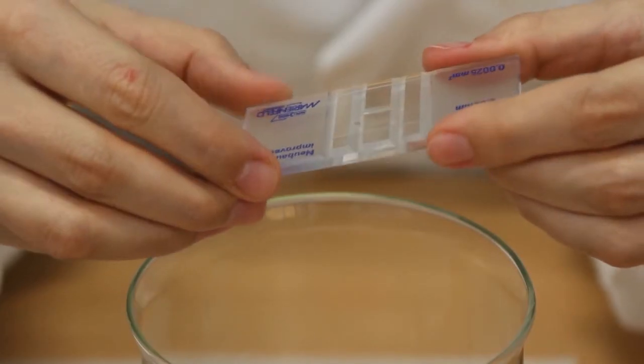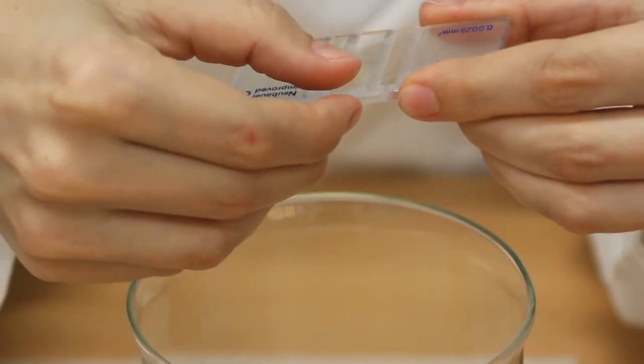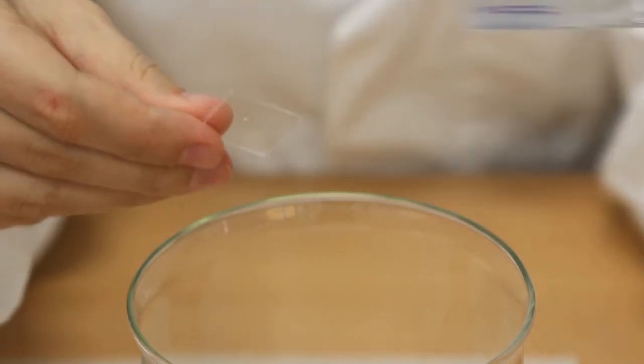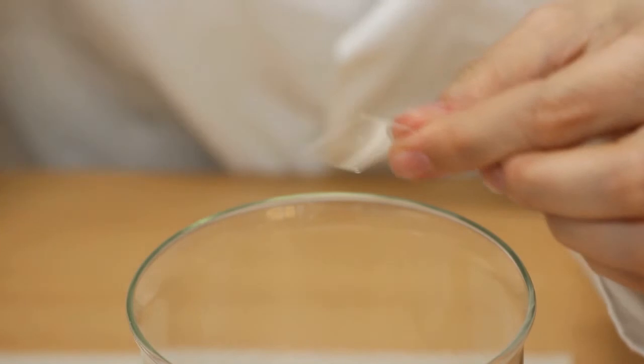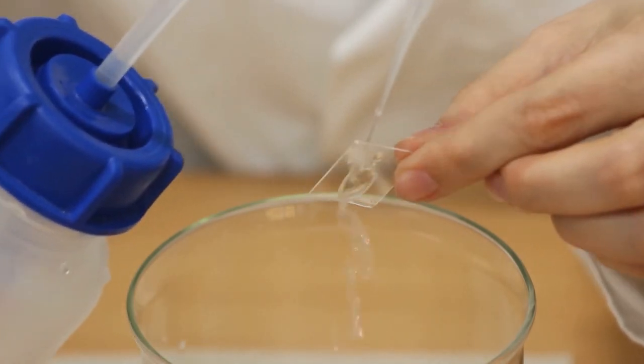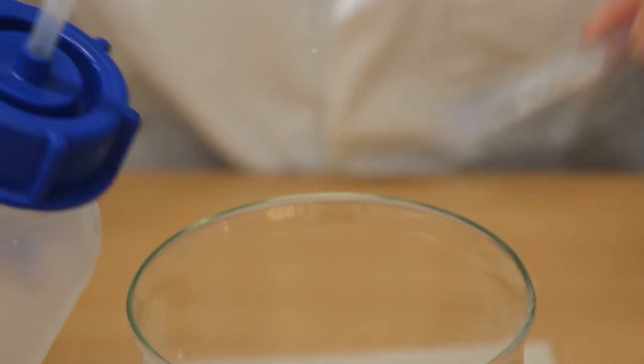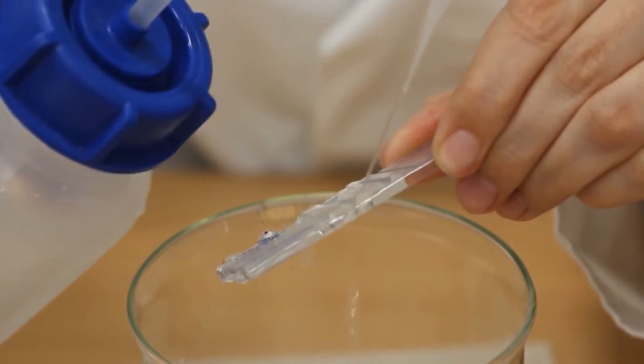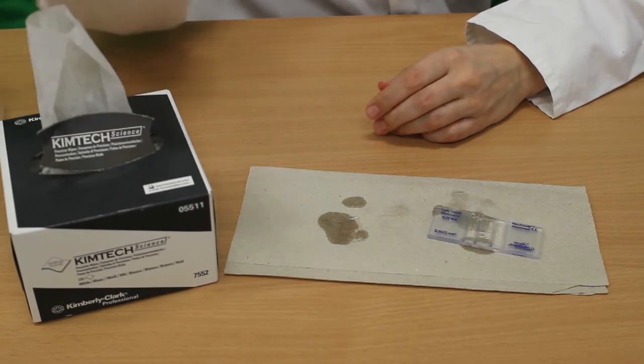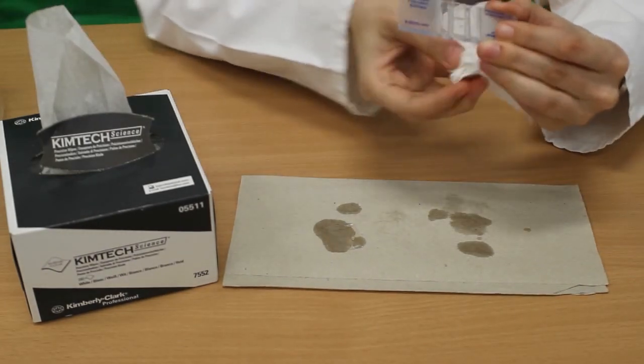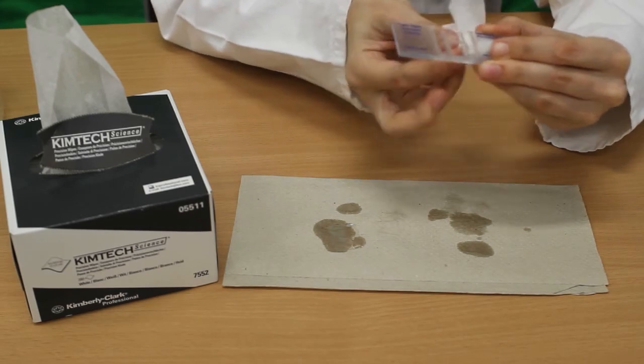When you are done with counting, remove the coverslip carefully from the side. Rinse the coverslip with water and the slide. Dry both with a piece of paper. Pay attention not to dry the middle structure, since this can destroy the counting grid.